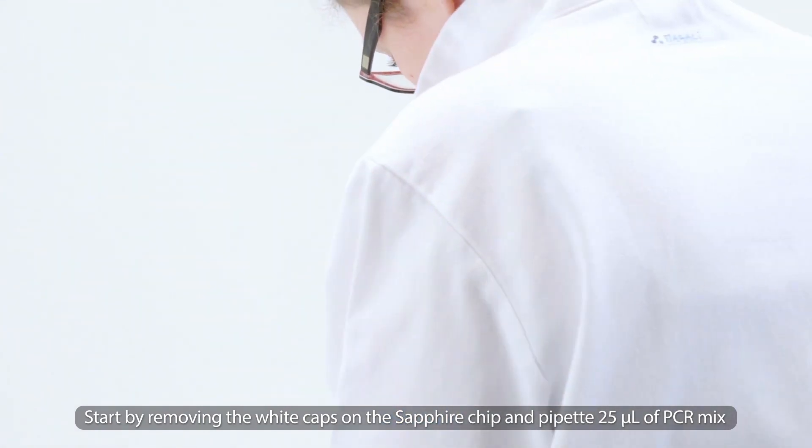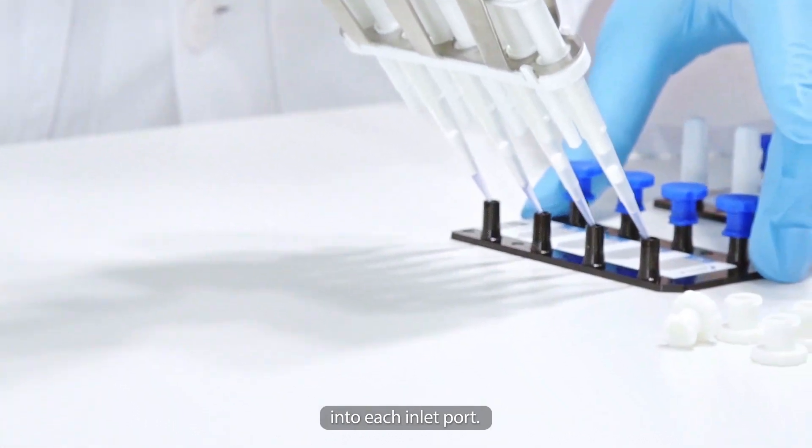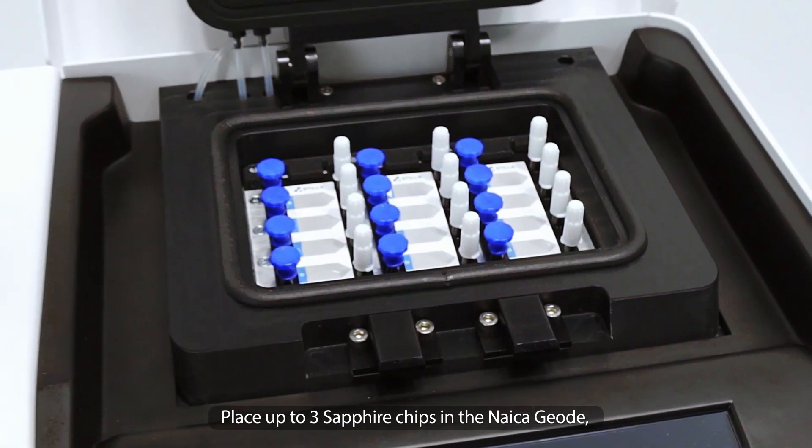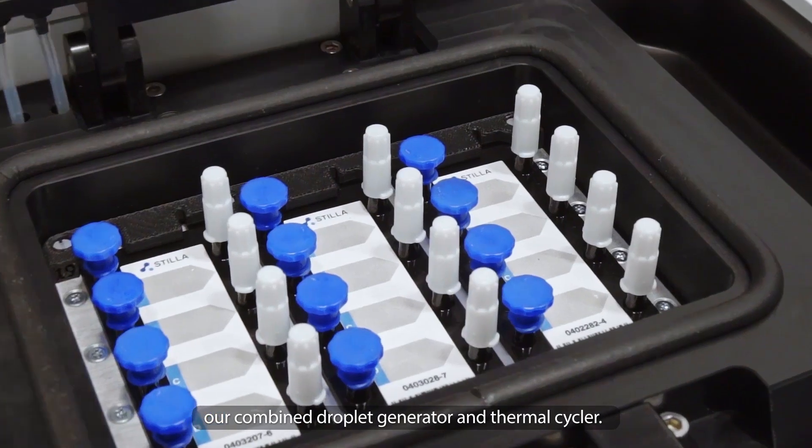Start by removing the white caps on the Sapphire chip and pipette 25 µl of PCR mix into each inlet port. Then simply seal with the PCR caps and place up to three Sapphire chips in the NICA geode, our combined droplet generator and thermal cycler.